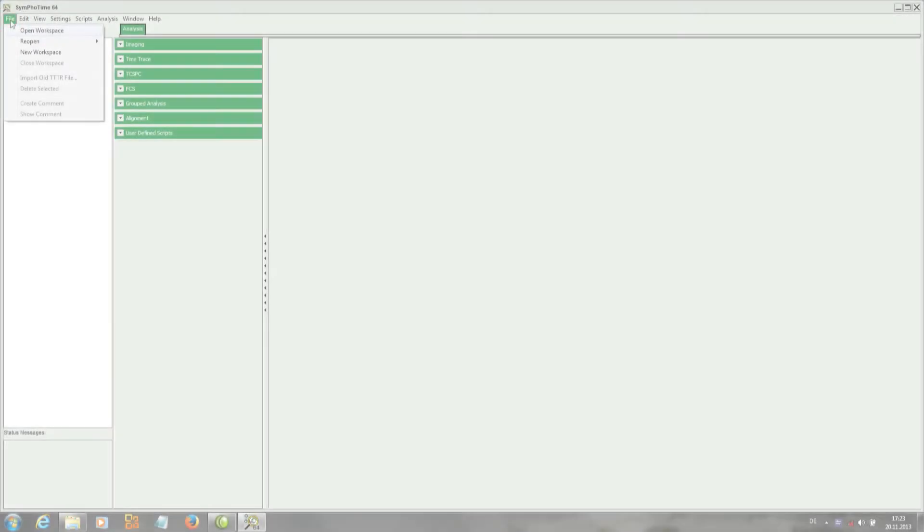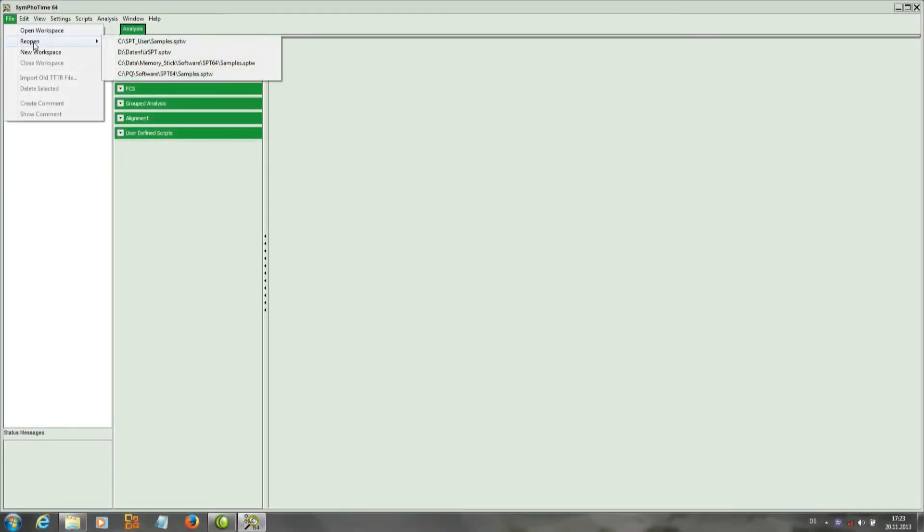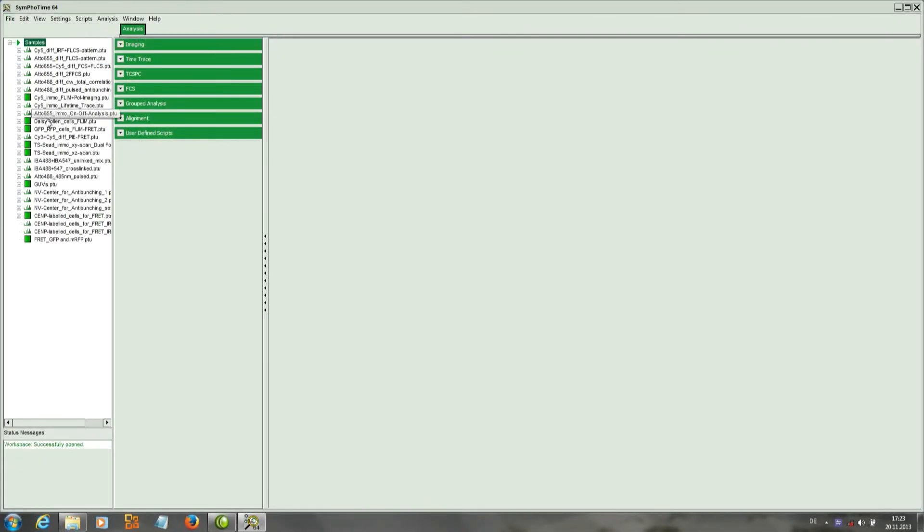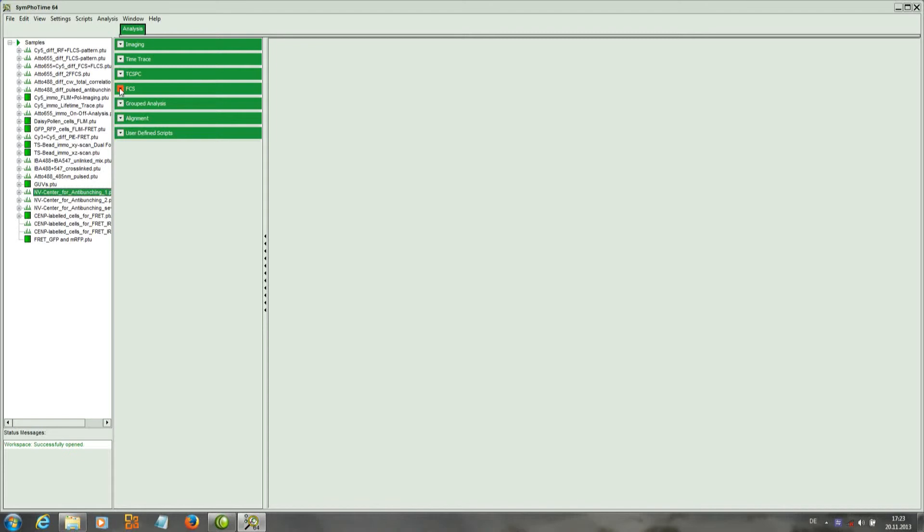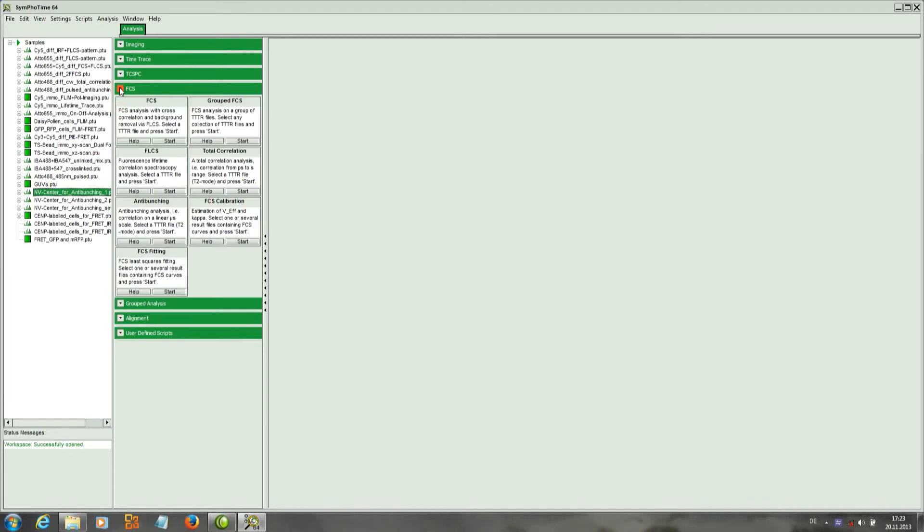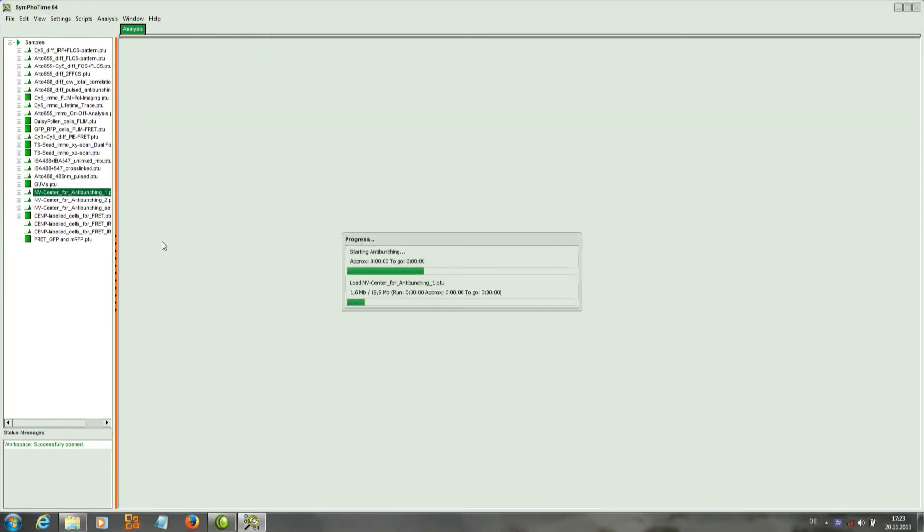In this tutorial we will show how to do anti-bunching with the SymfoTime64. We have three files that contain single traces of diamond vacancy centers. We take the first one and open it with the anti-bunching script.